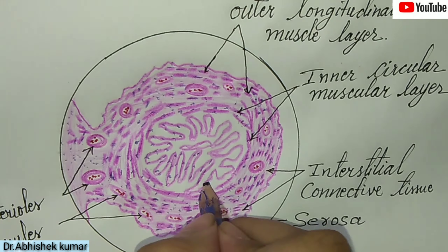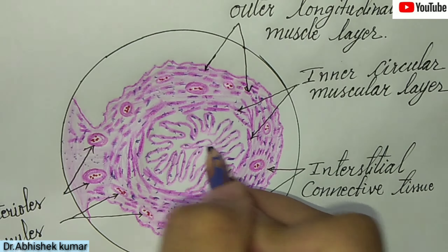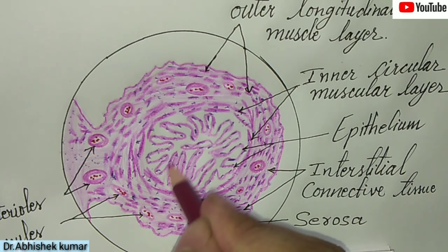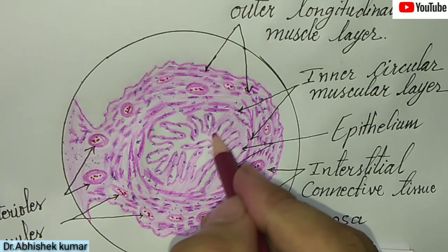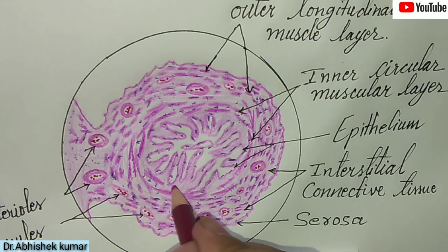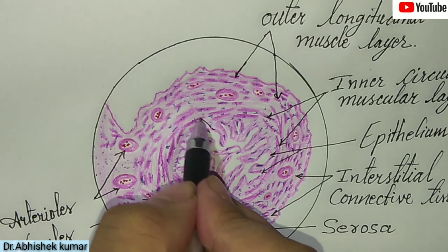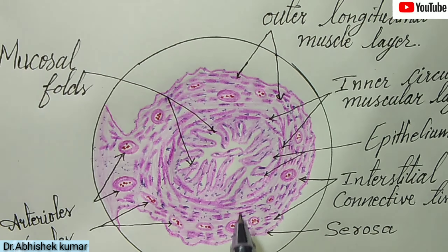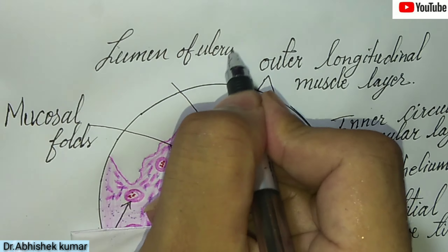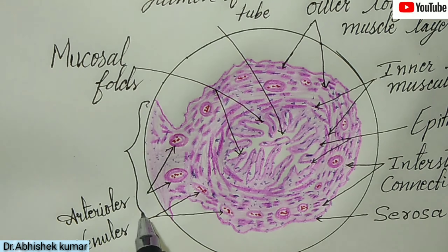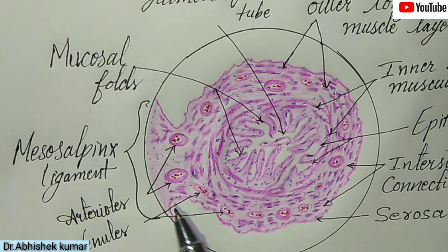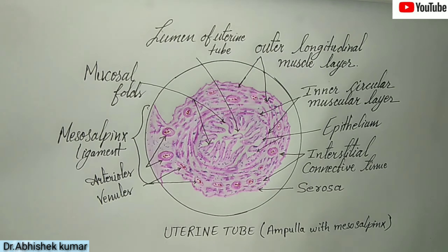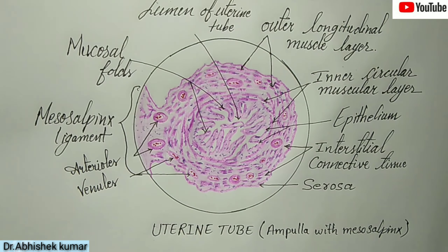The mucosa of the uterine tube consists of a simple columnar ciliated and non-ciliated epithelium. The mucosa of the ampulla exhibits the most extensive mucosal folds, which form an irregular lumen in the uterine tube. Here is the mucosal fold, here is the lumen of the uterine tube, and here is the mesosalpinx ligament completing the uterine tube structure along with the ampulla.